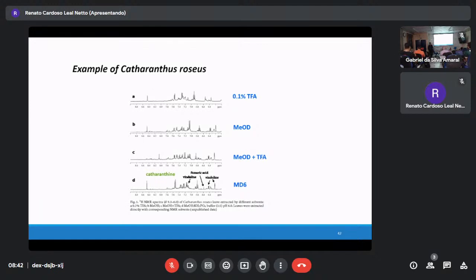Now I'm interested in this compound. At the extraction level, if you have the best product, I extract only this one, because I suppress the others. That's why they use TFA. Yield is important, selectivity is important. But in our case, profiling technique, selectivity is the opposite. We have to do an unselective method. That is the point.